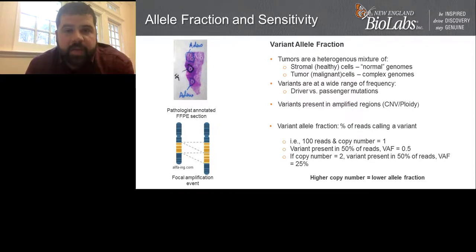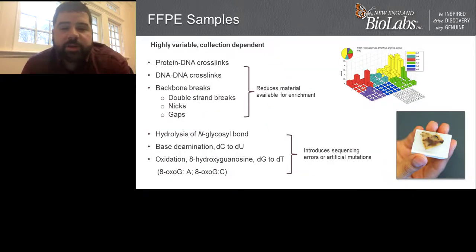I think further complicating this is the fact that you have false positives that arise from errors that are happening in a biological sense, that have to do with things like storage. So a great example of that is FFPE samples. These tend to be highly variable in terms of quality. We've seen samples from FFPE that look as good as fresh frozen tissue, that could be very old, but were collected properly in a clinical setting, were stored properly, that look very good.